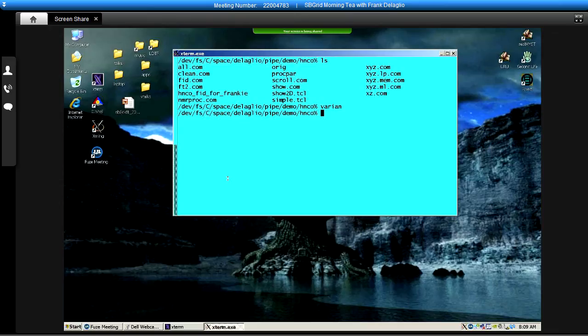And we have a simple graphic interface to help us with these steps. It's the same graphical interface for all types of data, but we invoke it a little differently depending on whether the data is from a Bruker instrument or from a Varian and Agilent instrument.